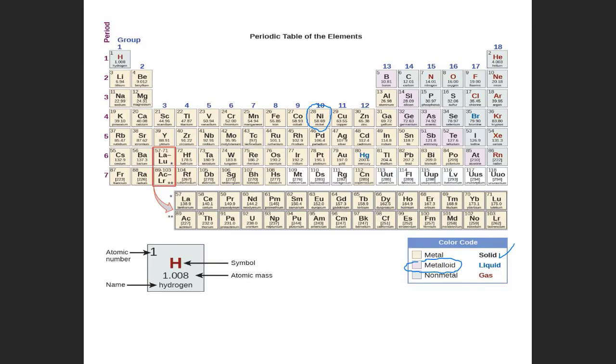The second part, okay, you're going to observe in the sample, the second element is tin, and you are going to do the same thing. You're going to say, okay, where is tin? Okay, here. They will ask you for the symbol as well, so you will have to write the symbol.